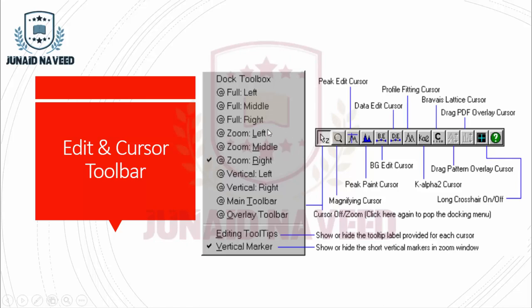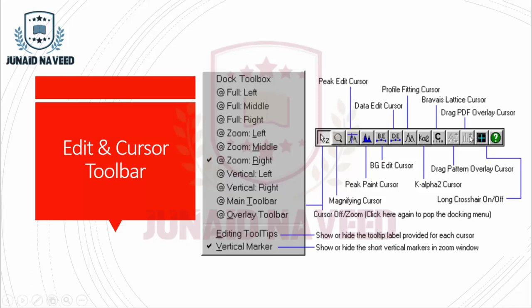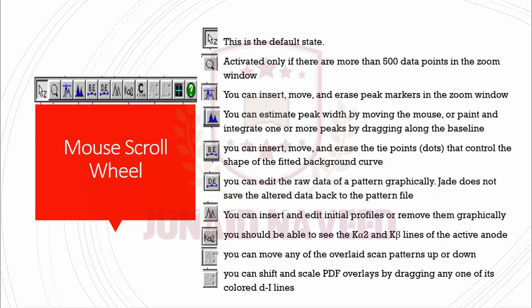You can adjust different docking options from this window. The second button is basically Magnifying Cursor, the third one is Peak Edit Cursor, Paint Cursor, Background Edit Cursor, Data Edit Cursor, Profile Fit Cursor, K Alpha 2 Cursor, Drag Pattern Overlay Cursor, and Drag PDF Overlay Cursor.